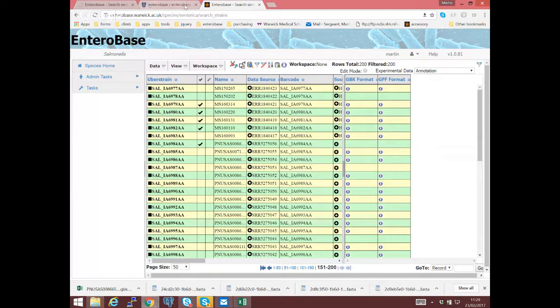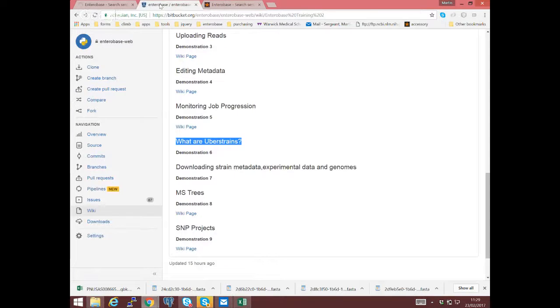Martin, I have a question. What kind of annotation do I get? You get either GenBank or GFF format. How are they generated? This is just generated by Prokka. So you can load them into Artemis or another suitable program. I think Artemis takes both GBK and GFF format.